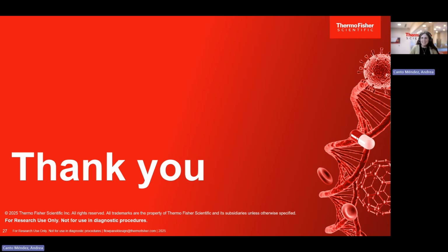Yes, thank you. As you might have guessed already from my role, I really love flow cytometry, and this is very dear to me, but we have to realize that it has limitations. Although spectral flow is advancing a lot and allowing us to measure more and more targets every time, sometimes we just have a sensitivity threshold that flow cytometry cannot surpass.